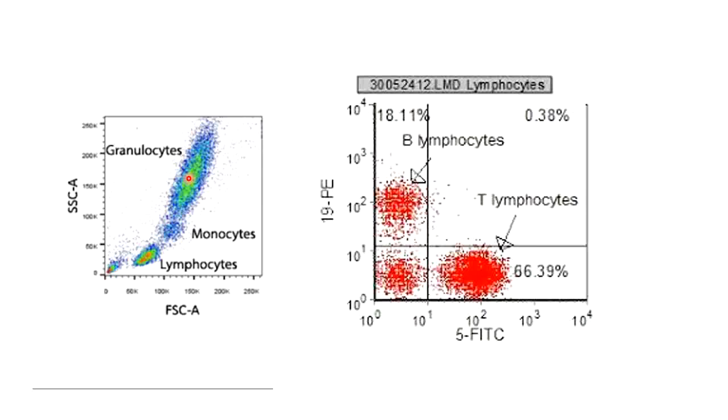Now everybody knows the use of Microsoft Paint. In Paint, you can select something. Here also I can select like this. I can select this area and tell the software, tell me how many cells are in this area. Then the software will calculate and say you have 50% of the cells. 50% of what? Whatever cells are present in this graph, 50% of them are lymphocytes.